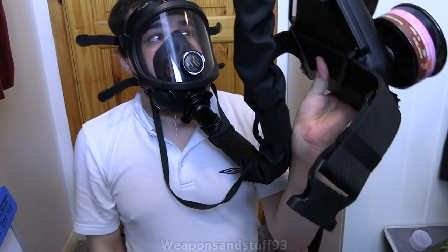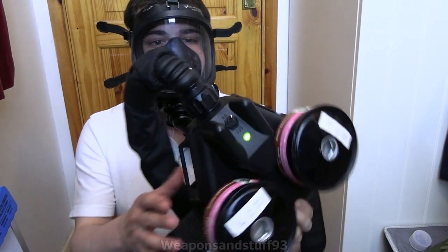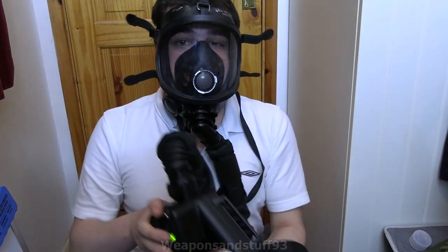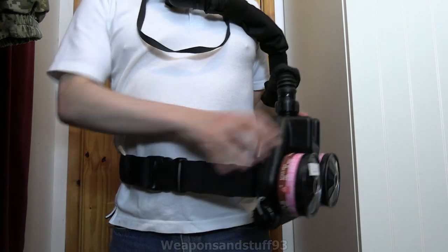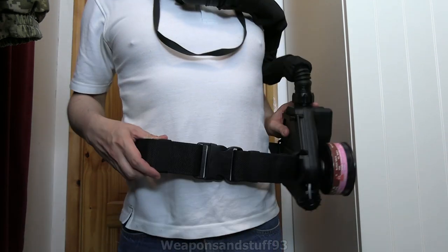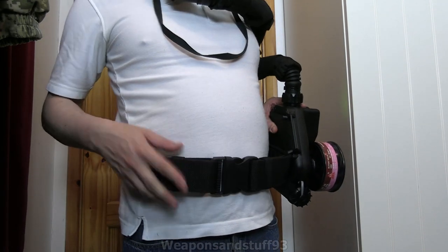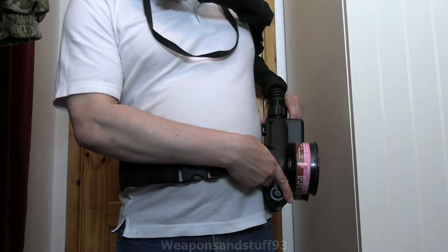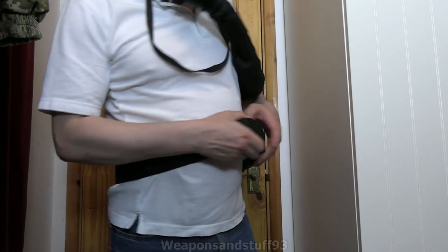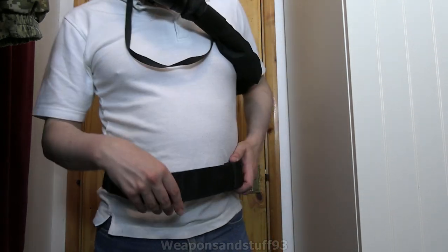As for how this attaches to you, you can obviously attach it in different ways using different belts and systems, but the preferred way is basically to go on you as a belt. All it does is you put the clasps shut on there, then you tighten it — grab it in front, on the side, behind you, whatever — and it works absolutely fine. So that's the C420.